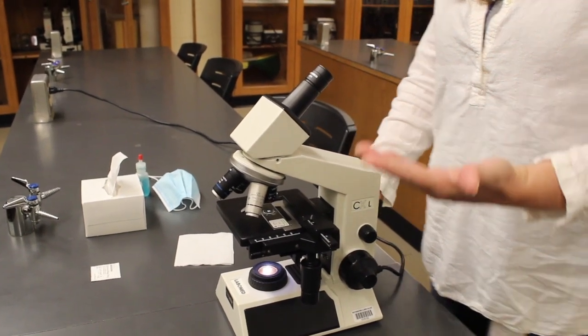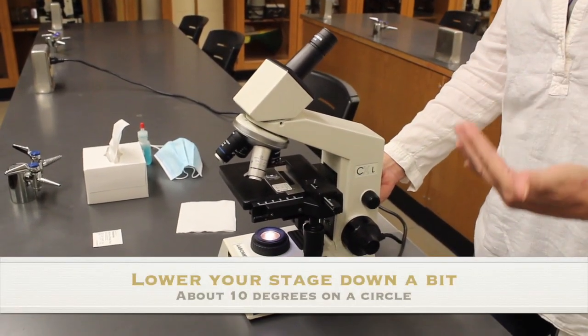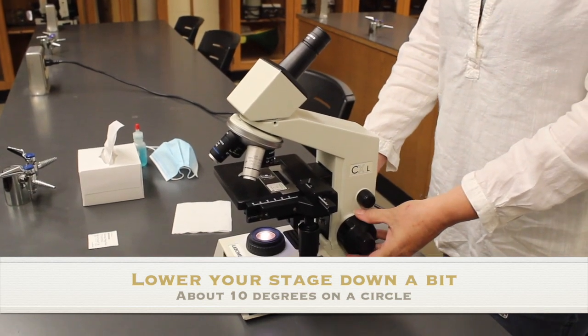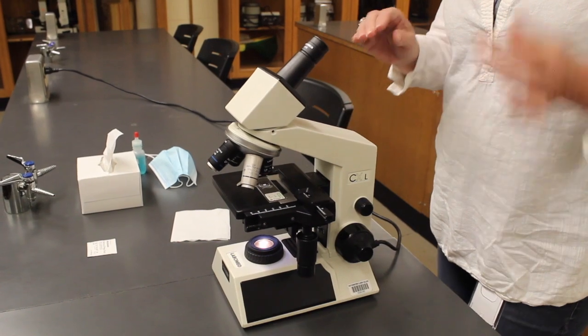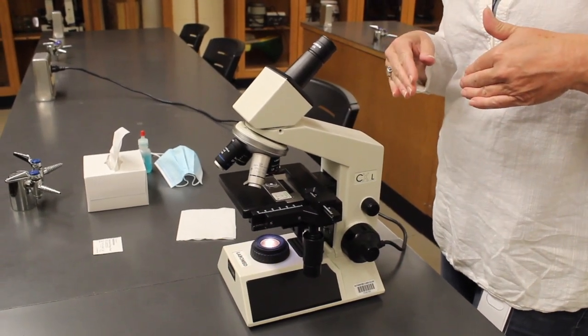And that is, I'm going to lower my stage down just a scooch. So I'm going to do that again without looking in. But if I lower it just a tiny little bit, it's going to be close to being in focus.